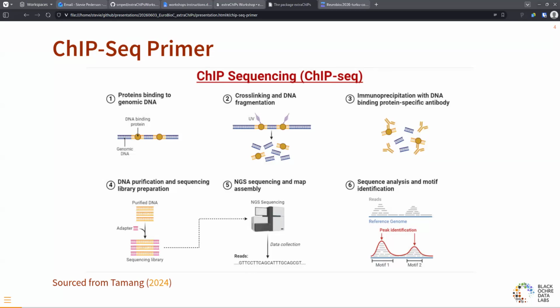I had a great discussion with Damien over lunch, and he was saying, why are you doing ChIP-Seq? There's all these new technologies, CUT&RUN, CUT&Tag, and they're much better. My perspective on that was absolutely yes, when you're calling peaks. But when you're doing differential signal analysis, which is what we'll be doing today, where we're comparing across samples, we're going to have a fixed width peak.